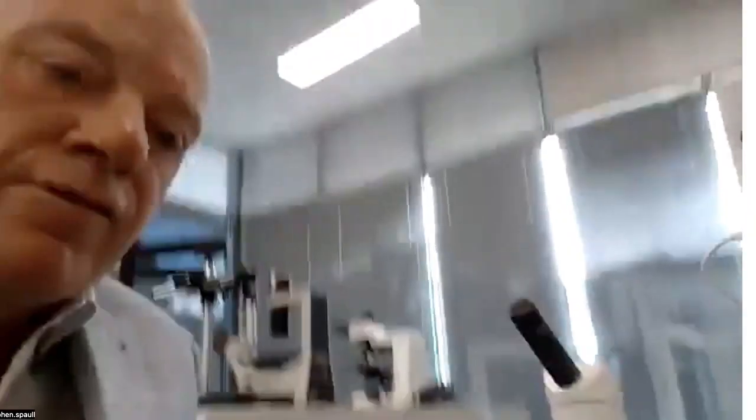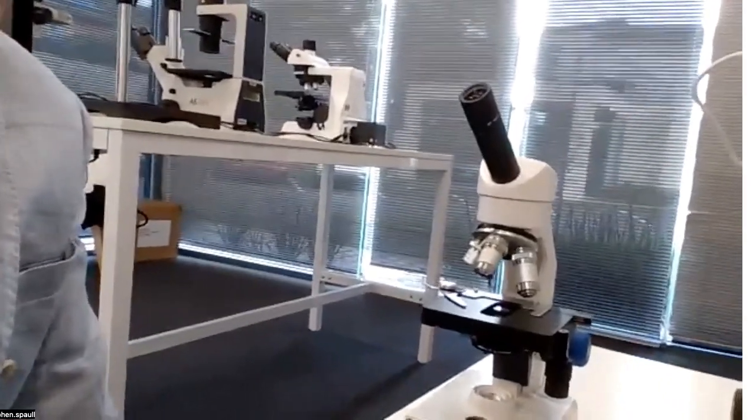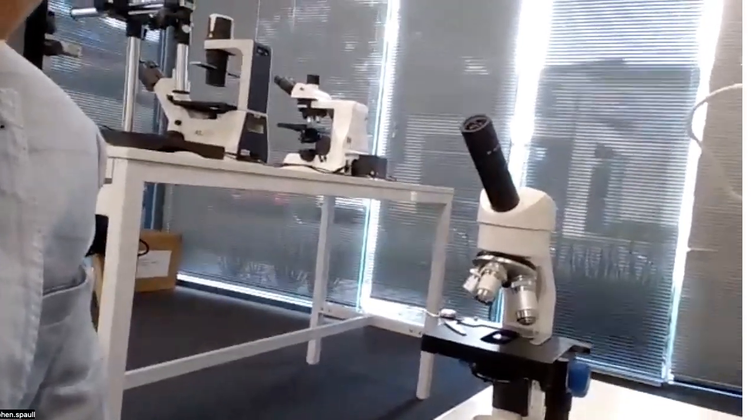We need to actually go through our microscopes. I'm going to have to swing this around, unfortunately. Okay, you have a monocular microscope there, which has no option for a camera.